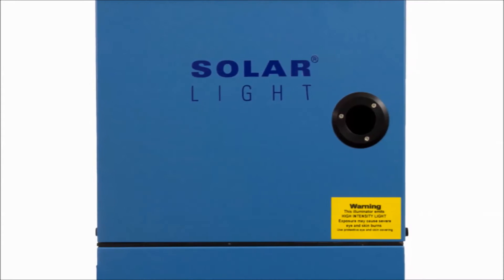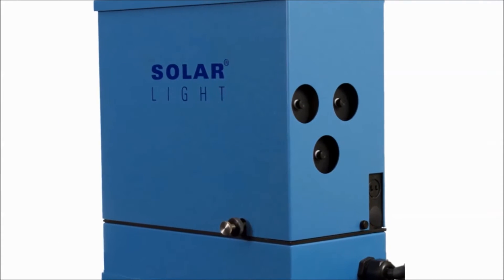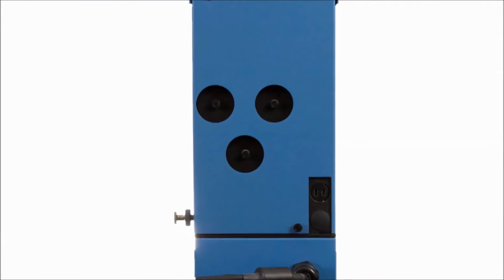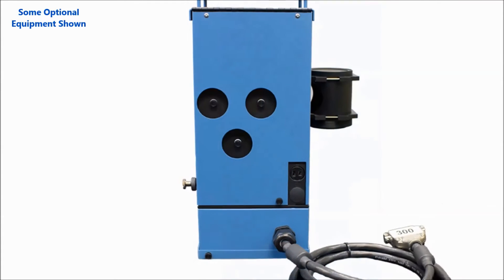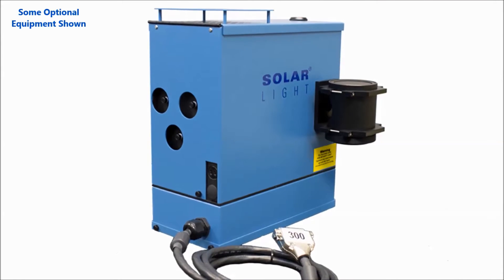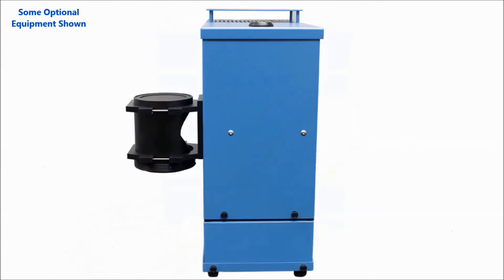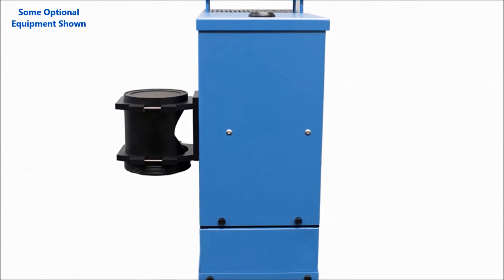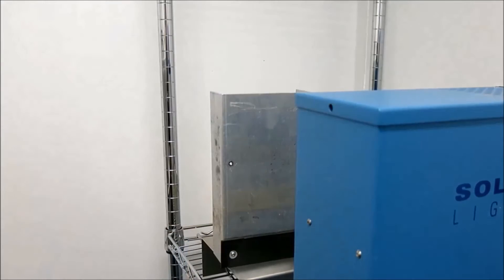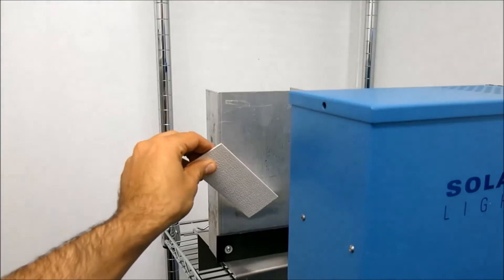Solar Light simulators in the 16S-series are high-precision turnkey fade and colorfastness testing light sources for professional and laboratory applications. The single output of the 16S simulator produces solar ultraviolet radiation in the range of 290 to 400 nanometers and can output a year's worth of ultraviolet radiation in approximately seven days for accelerated age testing. The 16S-300-003 accurately replicates the sun's ultraviolet portion of the spectrum and meets the latest standards for light sources by ASTM, including G151 and G155.